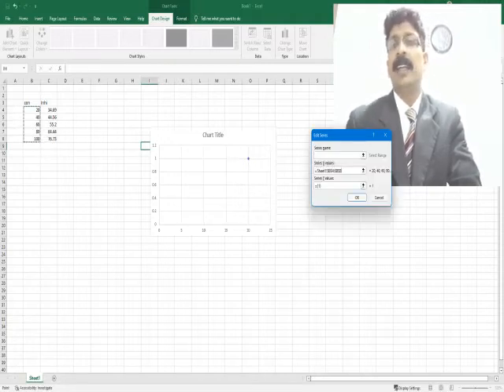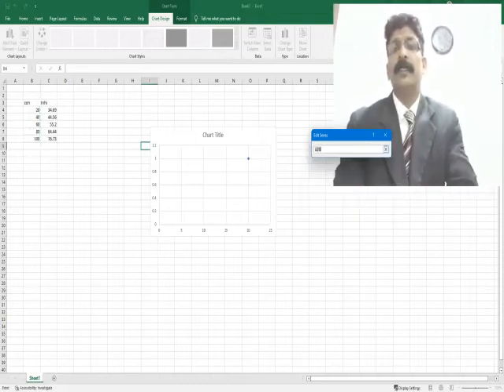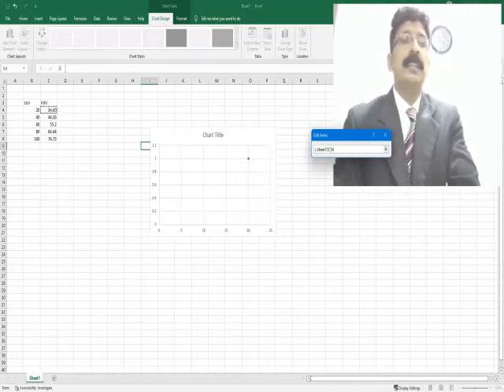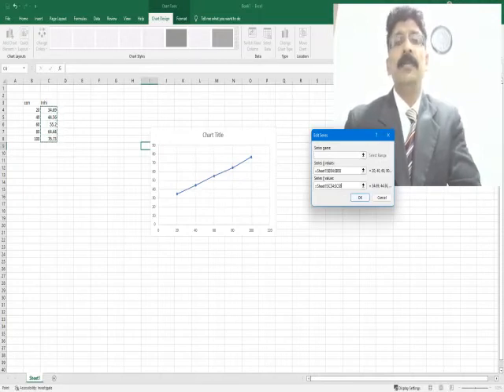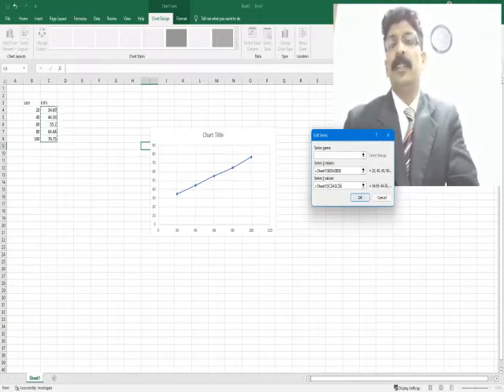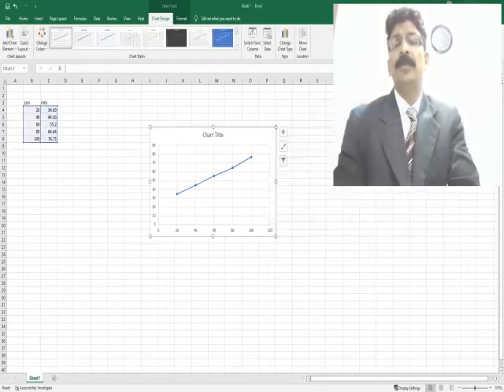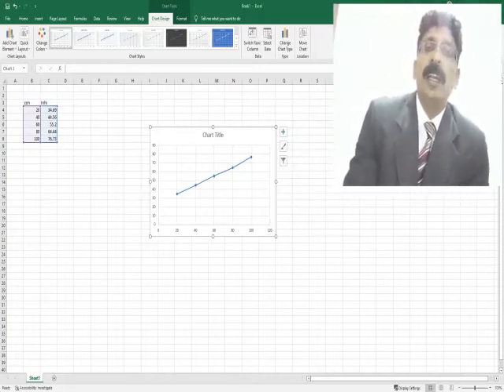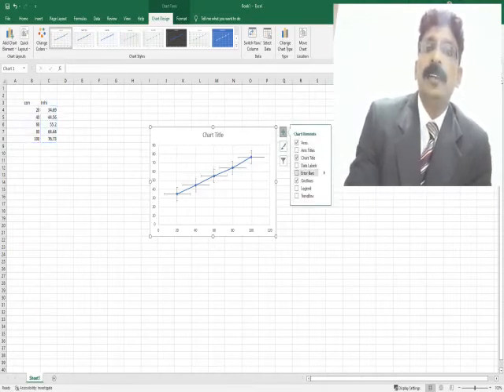Okay, and next you can go for the y-axis, and you select this inhibitory data and click here. You will get the graph here as shown, and put OK. And even you can put OK here also. Understand? Now you got a graph here, and if you want, you go to Add Chart Element and you can go for chart.